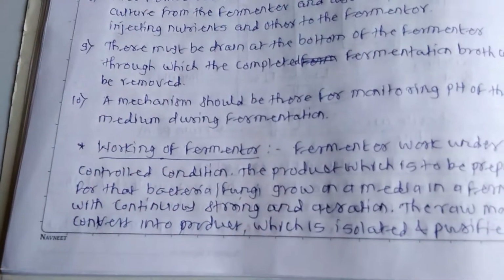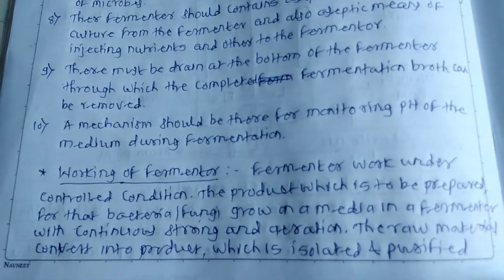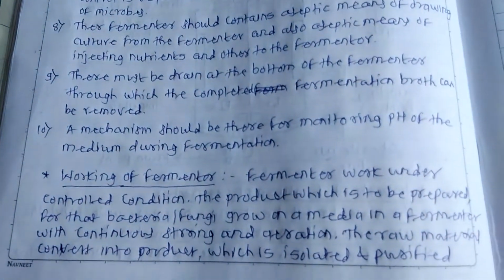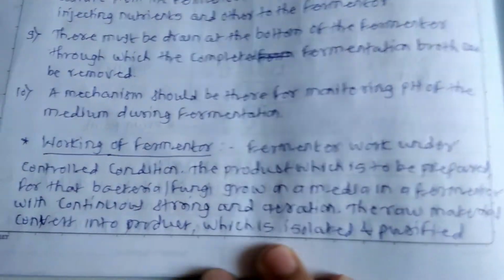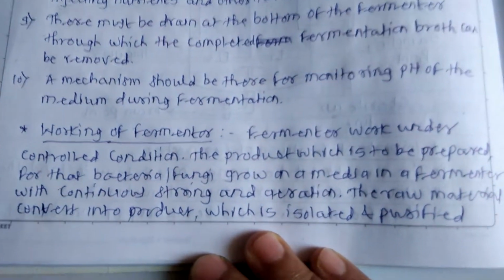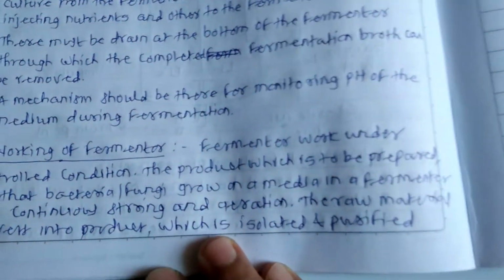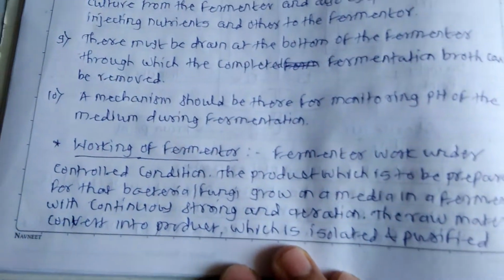Now, how does a fermenter work? You know the fermentation process. In a fermentation process, microorganisms grow on a medium, and the fermenter works under controlled conditions: a specific temperature, a specific pH, inflow of fresh media and outflow of used media. All these conditions are maintained.